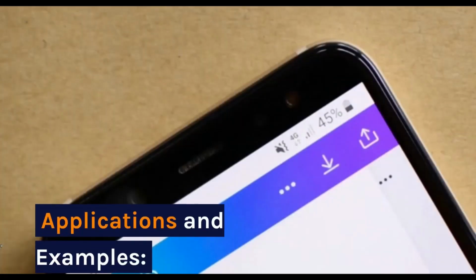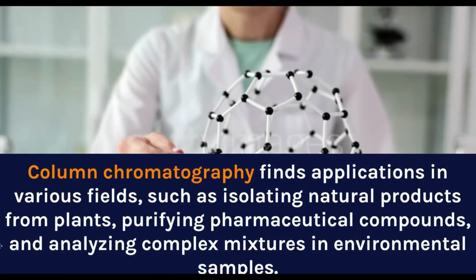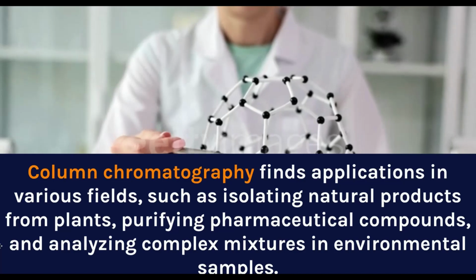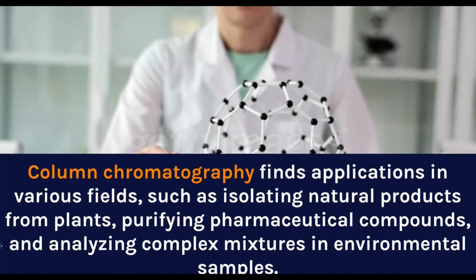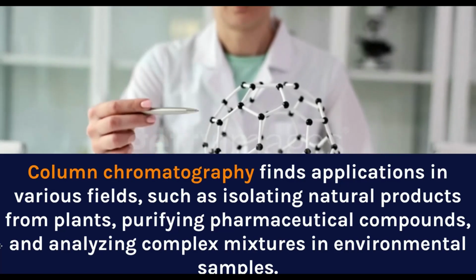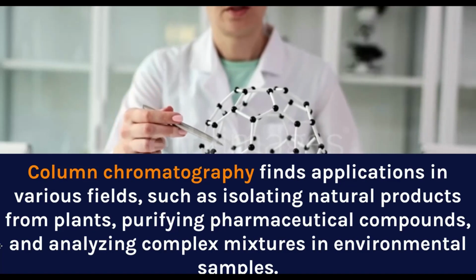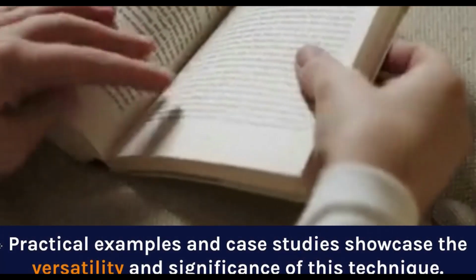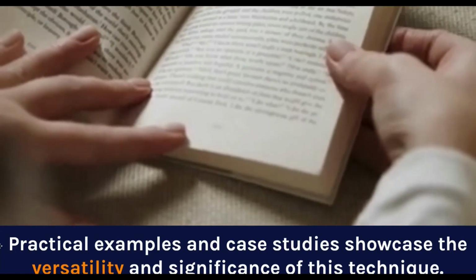Applications and examples. Column chromatography finds applications in various fields, such as isolating natural products from plants, purifying pharmaceutical compounds, and analyzing complex mixtures in environmental samples. Practical examples and case studies showcase the versatility and significance of this technique.